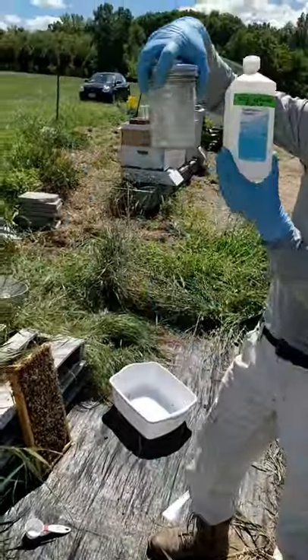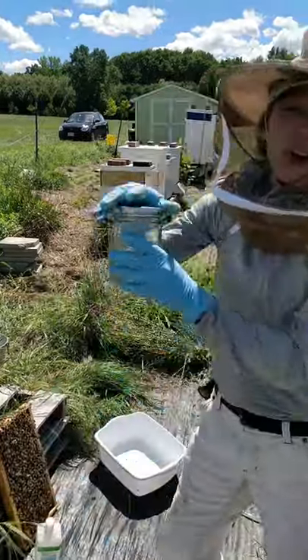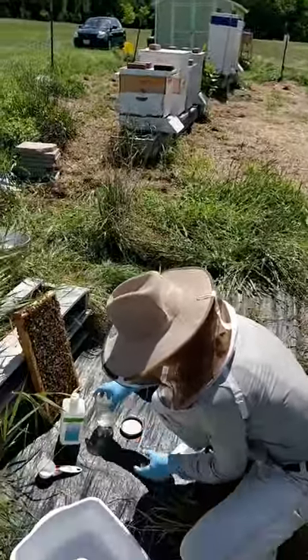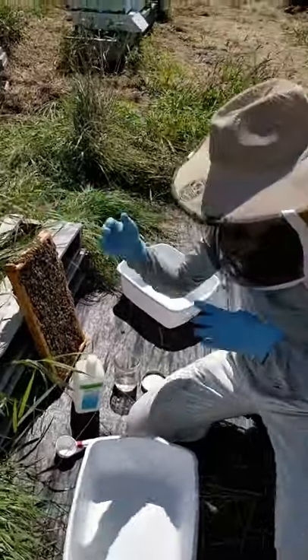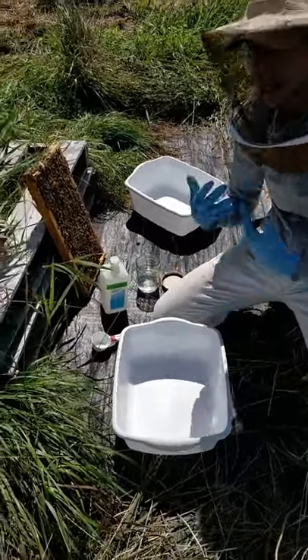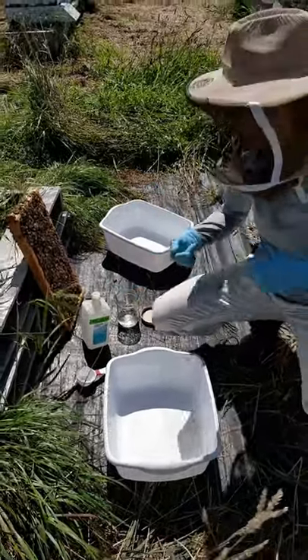Very critically, I'm going to open the jar now. This is a classic mistake — you get the bees in the bin and suddenly realize you have to unscrew the jar. So the jar is open, I've got the bin here. Now all I'm going to do is shake the bees into the bin and take two scoops and put them in the jar. These bees are going to die, which is unfortunate, but they're going to die for the greater good of the colony. Losing 300 bees is a lot better than losing 20,000 bees.